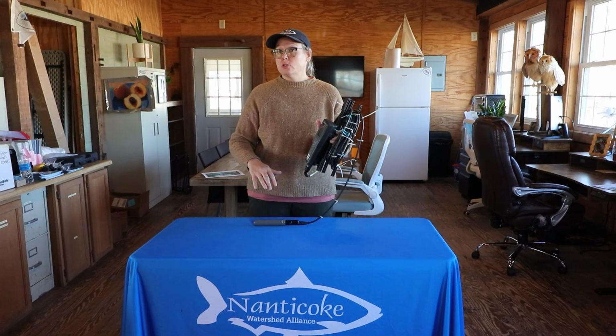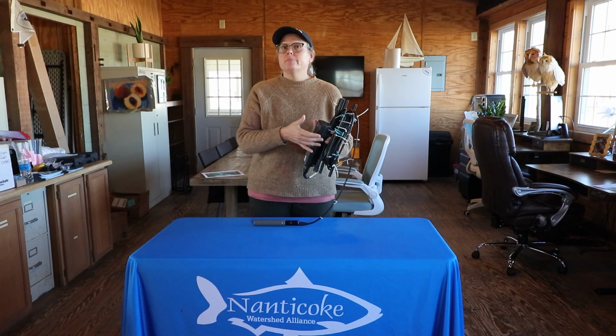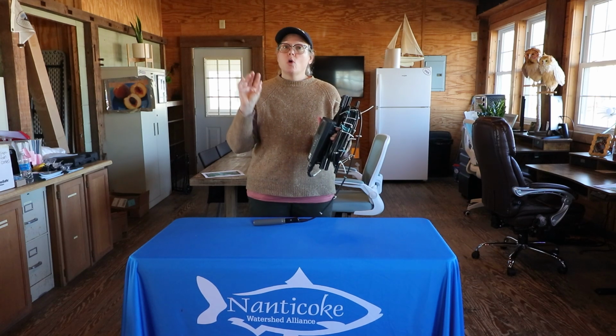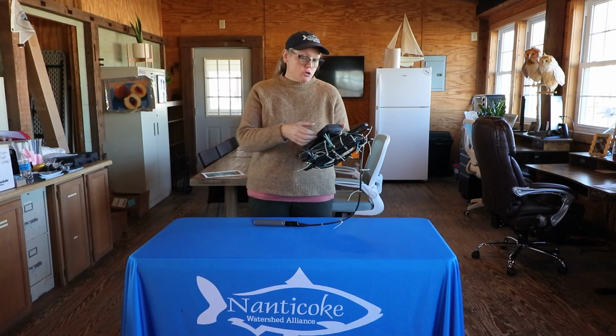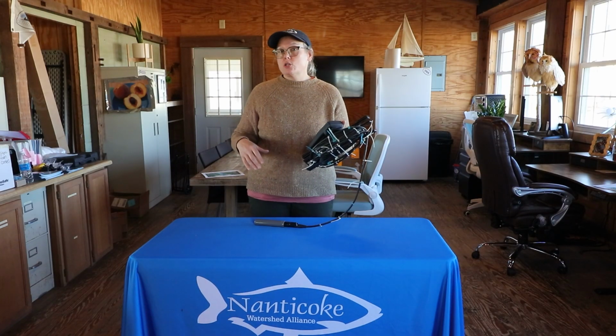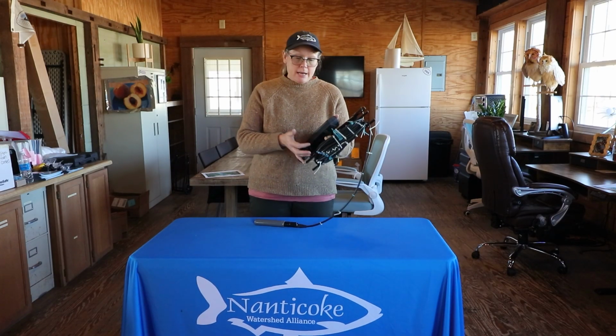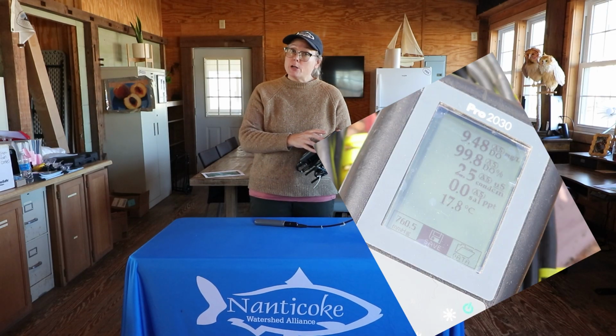all of your measurements. The DO meter, once it locks into data, it's only going to remain stable for a very short period of time. If you try to just call out the numbers, they will start fluctuating. Instead, if you save the data, you've captured the stabilized data.